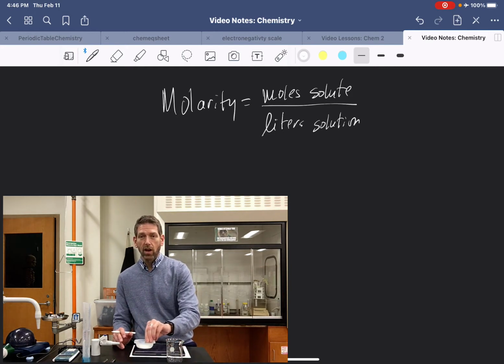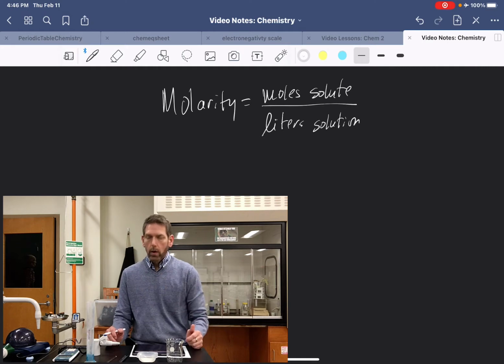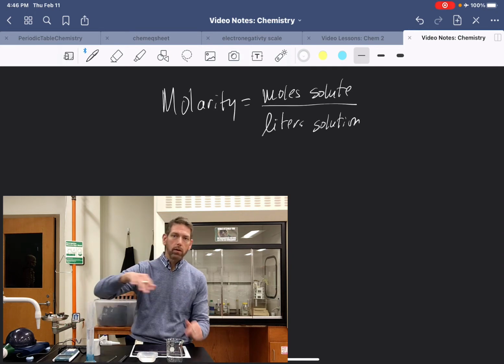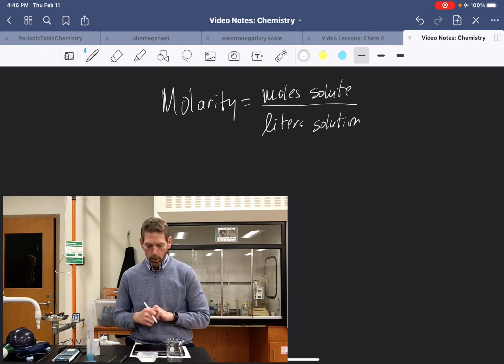Here I just got regular old table salt, sodium chloride. I've got a spatula, a stirring rod, and some water. And then you'll need a balance. Now I have an electronic balance over here, but in class a lot of times we use a triple beam balance. For the purposes of this video, I just need to quickly get a reading over here. So molarity, again, is moles of solute per liters of solution.